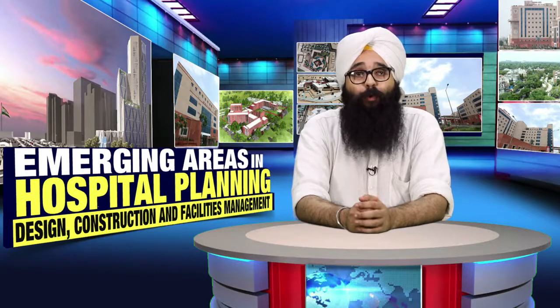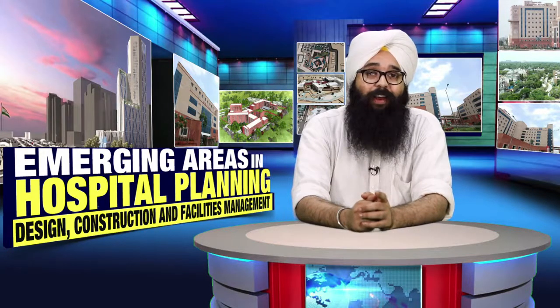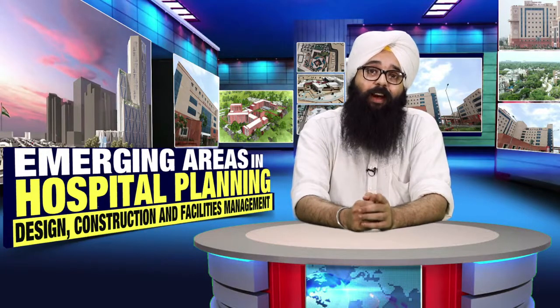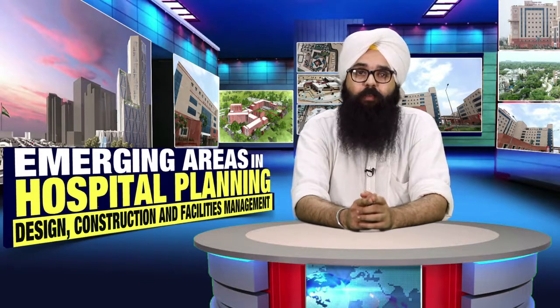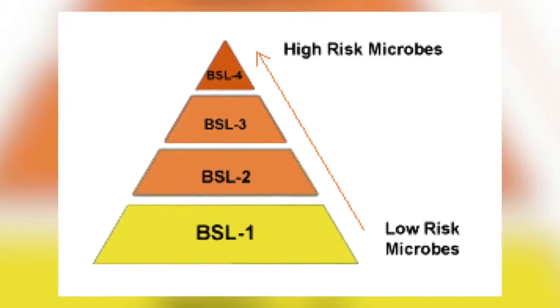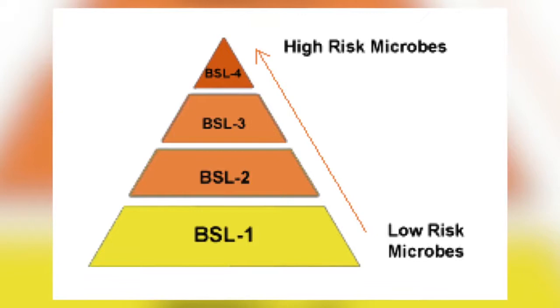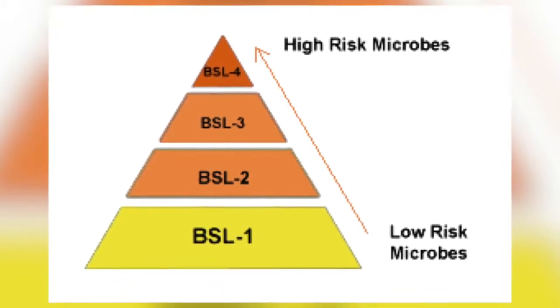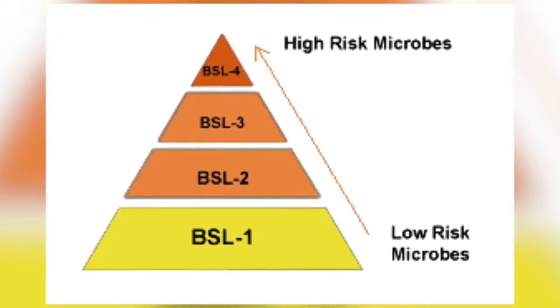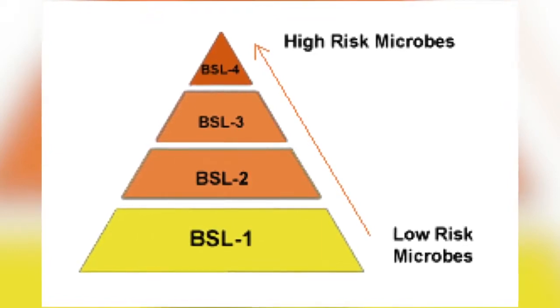There are four biosafety levels. We have studied risk groups, and now we will see that there are biosafety levels: BSL 1, 2, 3, and 4. Biosafety level 1 is for low-risk microbes and biosafety level 4 is for high-risk microbes.